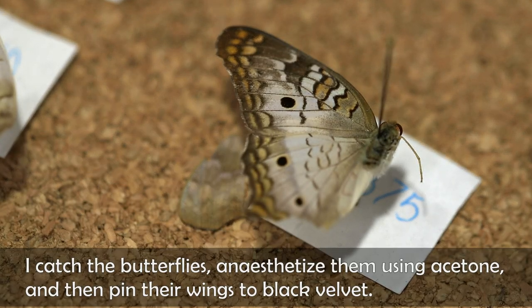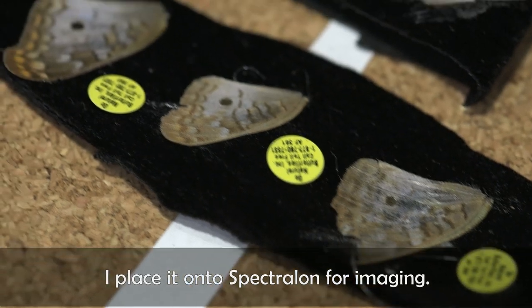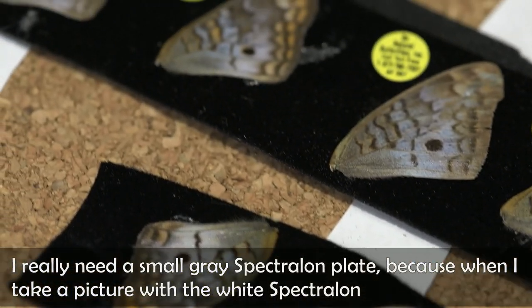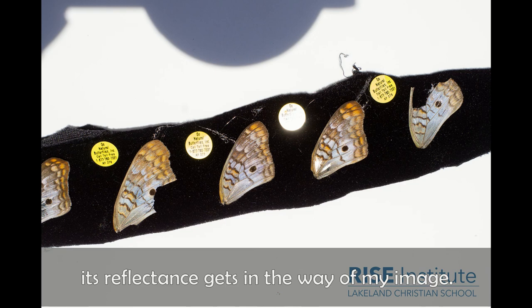I catch the butterflies and anesthetize them using acetone, then pin the wings to black velvet and place it on the spectrolon for imaging. I really need a small gray spectrolon plate because when I take a picture with the white spectrolon, its reflectance gets in the way of my image.